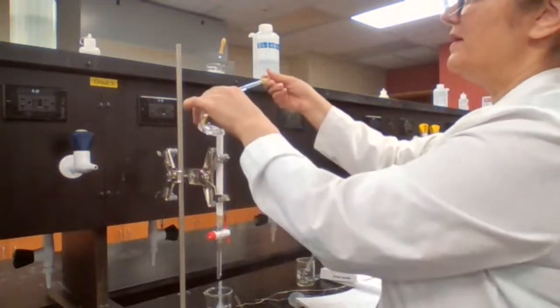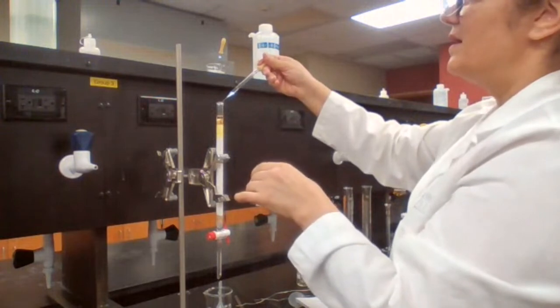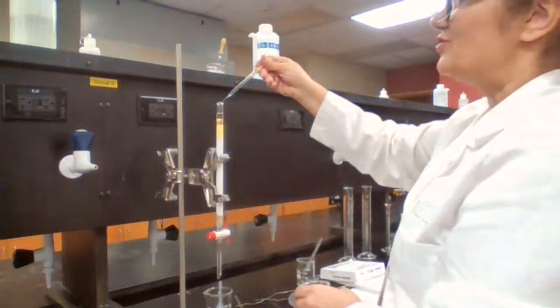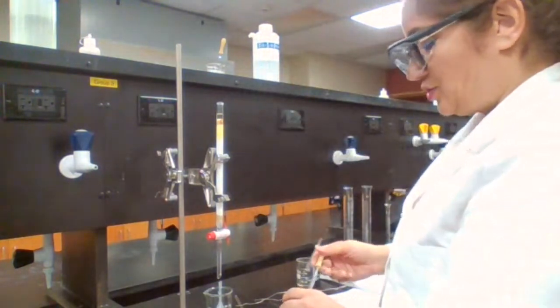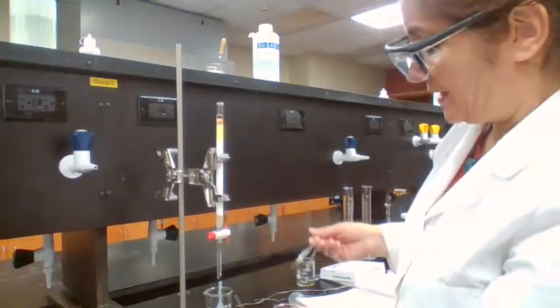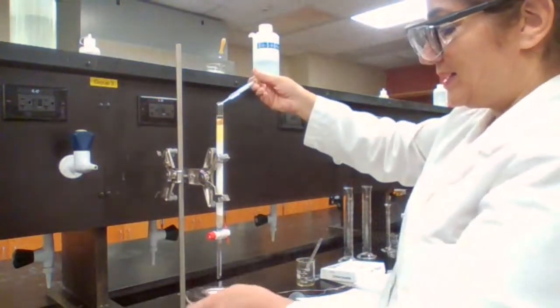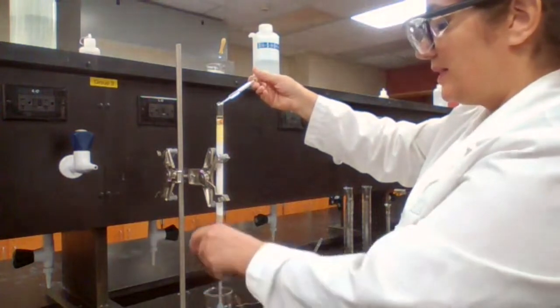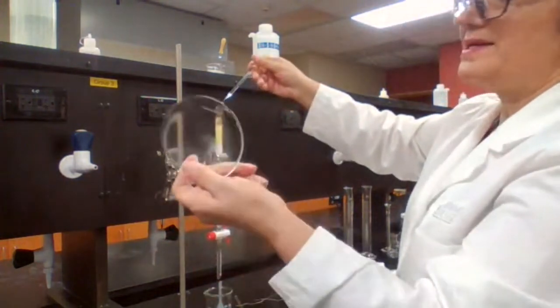And periodically, I have to test with a drop to make sure that the drop is just hexane, not hexane with fluorene. And you know the difference, right? At this point, you should know the difference. If it's just hexane, it's going to be clear. If it's hexane plus fluorene, it's going to leave a white residue.